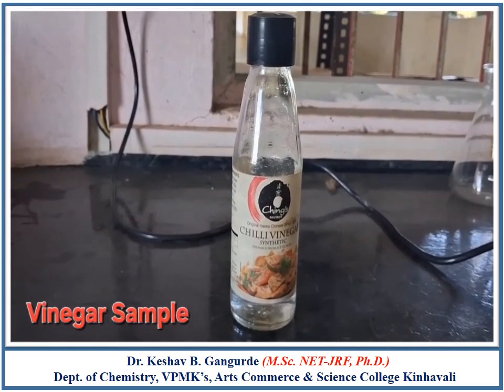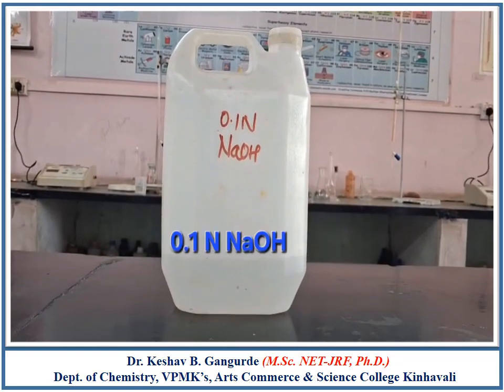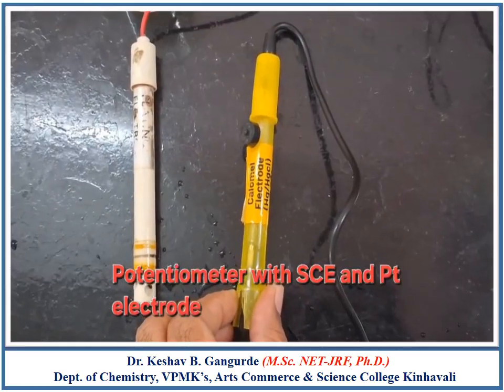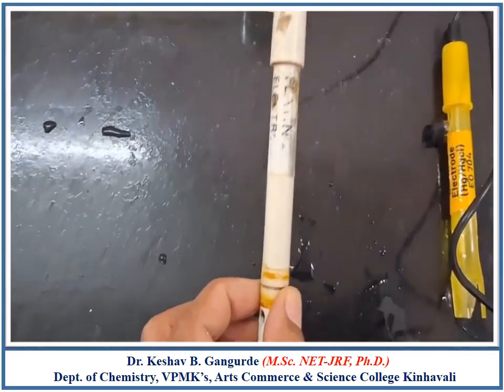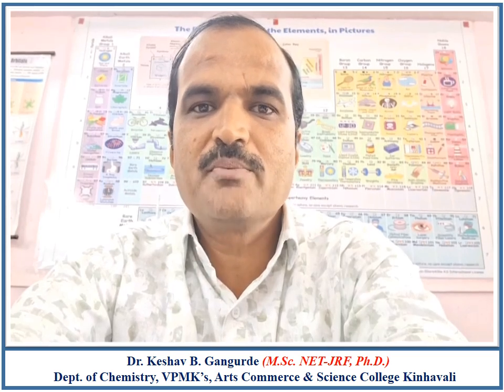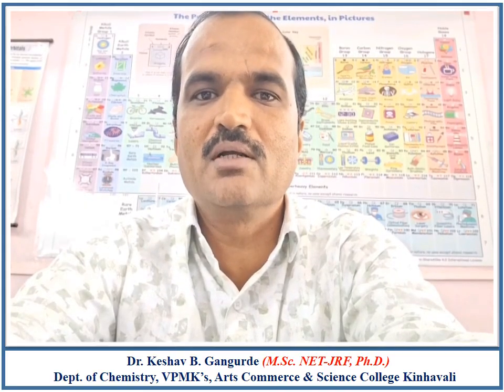For this experiment we require vinegar sample solution, which is 4% acetic acid, 0.1 normal NaOH solution, quinhydrone powder, a potentiometer, a saturated calomel electrode as a reference electrode, a platinum electrode as an indicator electrode, and a salt bridge. There are two parts of this experiment. Part 1 is standardization of NaOH solution and part 2 is estimation of acetic acid from vinegar.